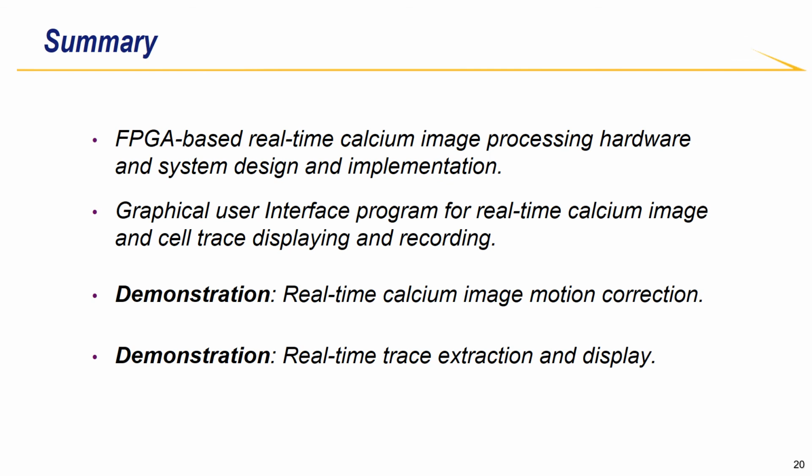In summary, in this presentation, we introduce our proposed FPGA-based real-time calcium image processing and trace extraction hardware system design and implementation. And we show the graphical user interface we built for real-time calcium image and cell trace displaying and recording. Based on these developed hardware and software, we demonstrated real-time calcium image motion correction and trace extraction for the LFOV Miniscope. We believe our work can enable novel closed-loop feedback neuroscientific experiments for brain research in the future.